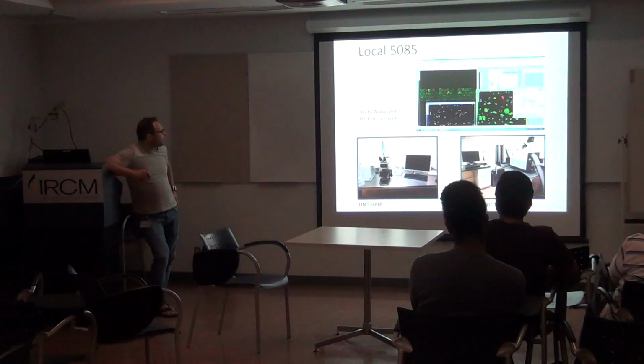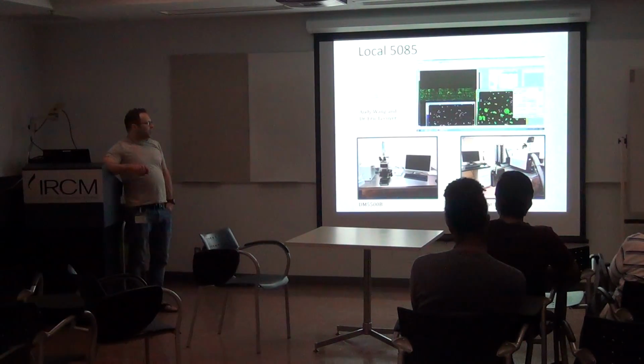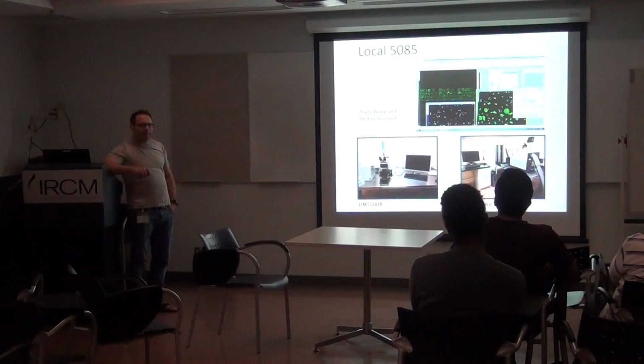There's also the high content screening. This is a device where you can just put your Petri plate. Usually it's a 96 well plate. So you put your specimen into it. You can have many plates, so it has a robot arm that takes the plate, puts it in the system, and takes many pictures in many wells.